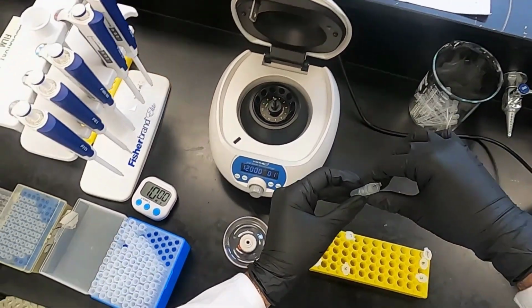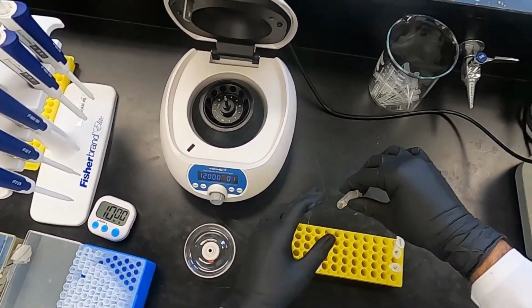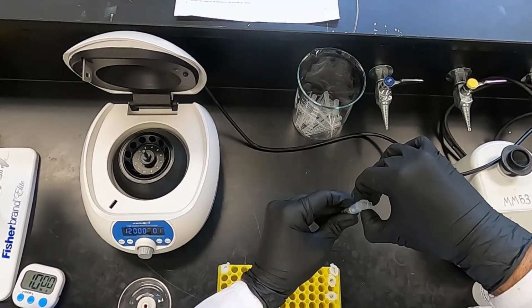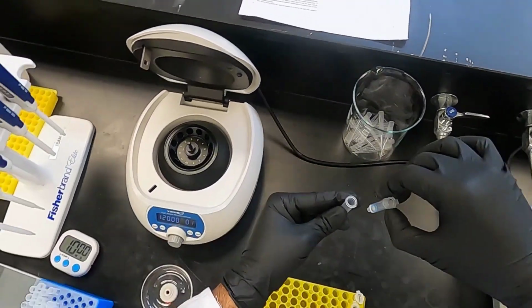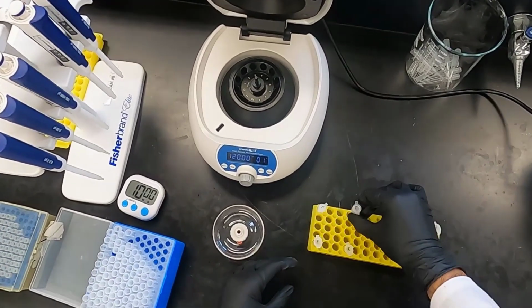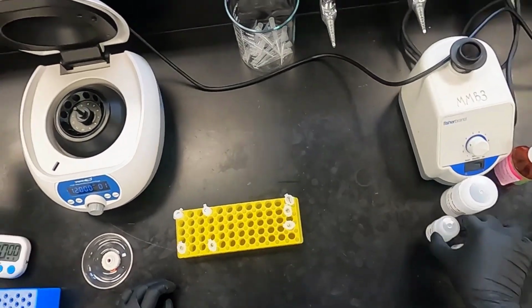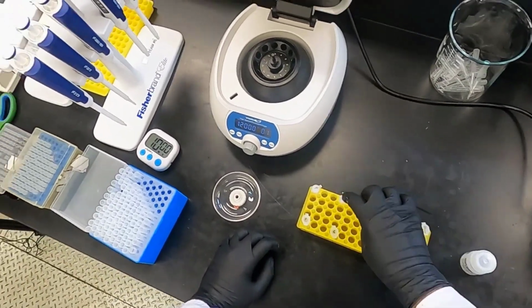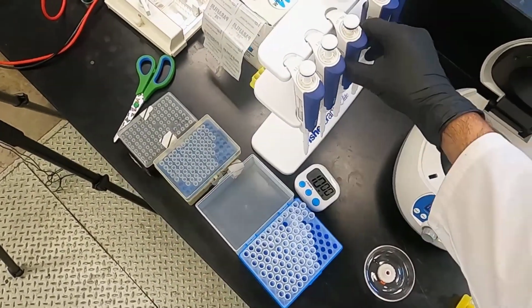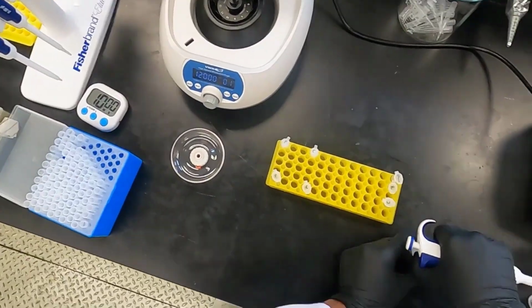At this point, we're going to be working solely with our column here. So we're going to do a series of 3 different wash steps to purify our DNA, making sure that we wash out anything that we don't want. So the first thing we're going to do is we're going to add PS buffer, and in each wash step we're going to add 500 microliters of our buffer to the column and spin it for 1 minute. Same conditions, 12,000 rotations per minute.